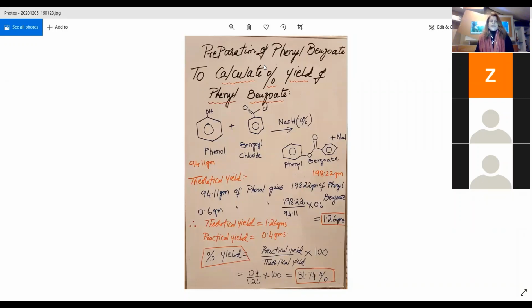Yes, ma'am. Okay. So now boldly answer this question to everybody, what is practical yield. Of course, the compound you have prepared in your lab, which the assignment was provided to you to do, and the product you got in the end, and you weighed it, you recrystallized it, and then you weighed it. This is called the practical yield.